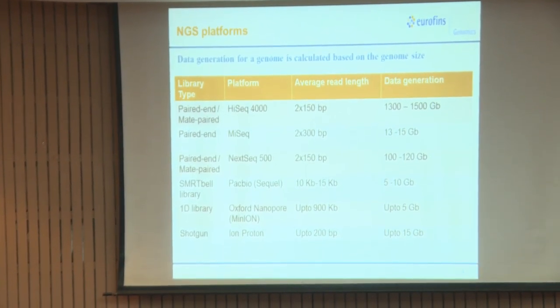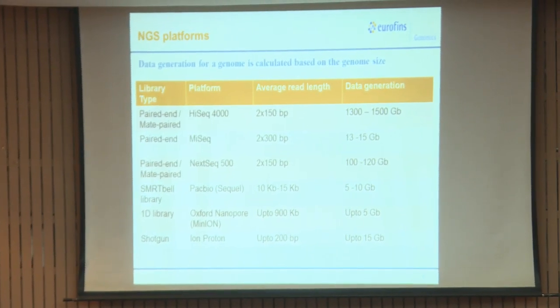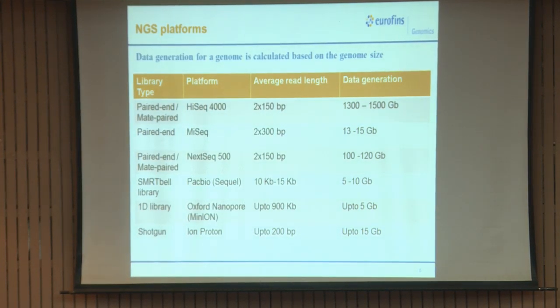Earlier what used to happen is, with these shorter sequencing chemistries, when we are doing a contig, we get a size in KBs, right. 1 contig or 2 contigs will be in the KBs, right. In this we get the sequencing itself in KBs. Just imagine the sequencing, if it is that big, the assembly becomes even easier, right.